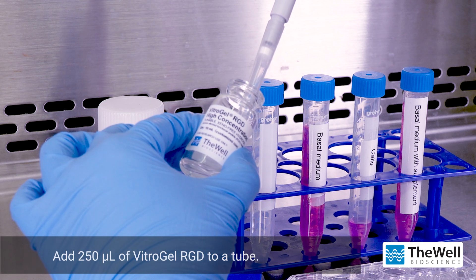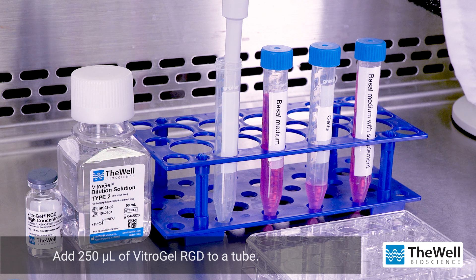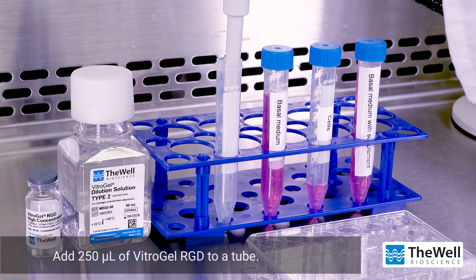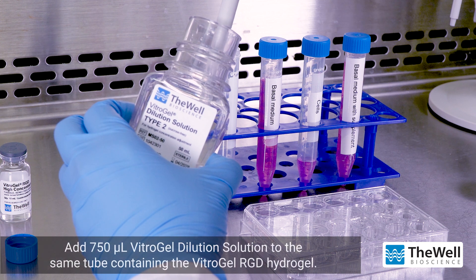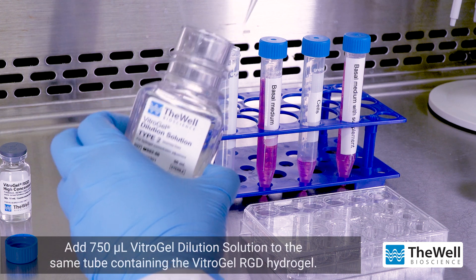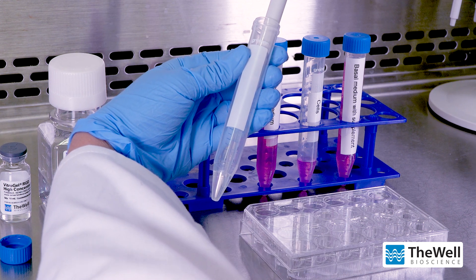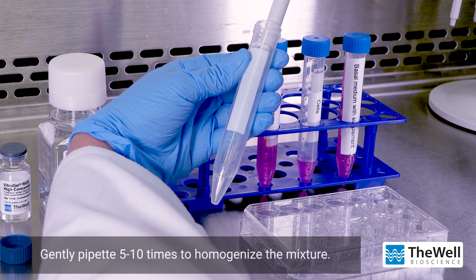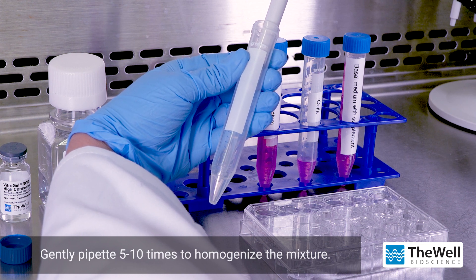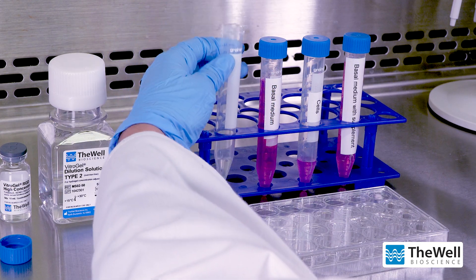Start by adding 250 microliters of Vitrogel RGD to a tube. Add 750 microliters of the Vitrogel dilution solution to the tube containing the Vitrogel hydrogel and gently mix 5 to 10 times. In this example, the dilution ratio is 1 to 3 of Vitrogel hydrogel to dilution solution. Refer to the protocol for more hydrogel dilution ratios for the desired hydrogel concentration.